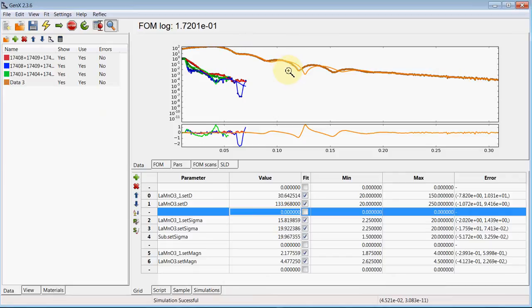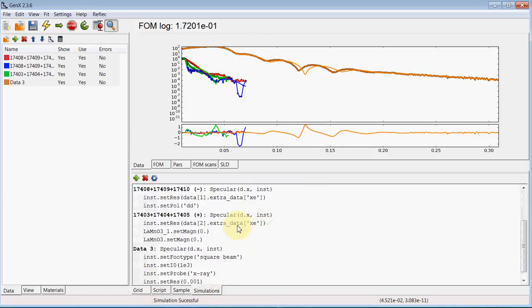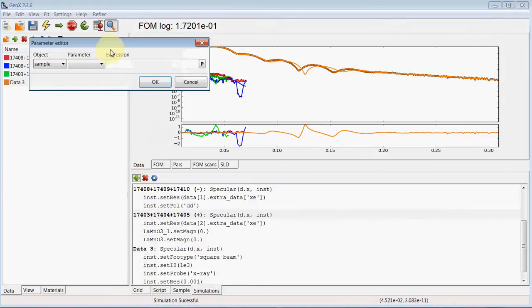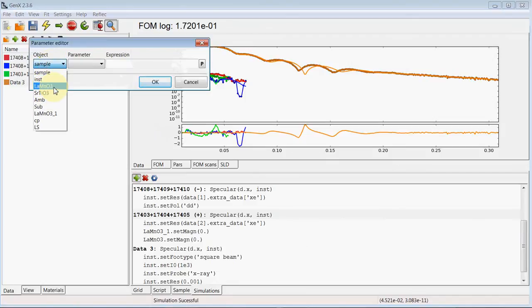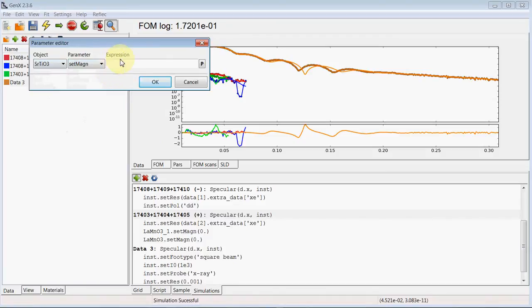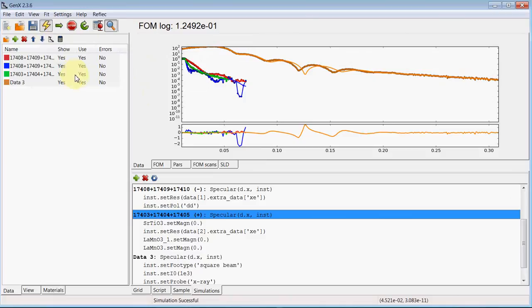The green data set looks strange because we forgot to set the magnetization of that layer to 0 for the third data set again. We add this again to the simulations parameter, magnetization of 0, and now X-ray and neutron data already look quite okay.